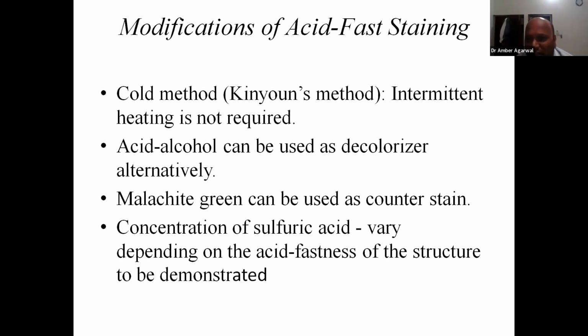Is Histoplasma capsulatum acid fast? This I would have to go back and check, it is a fungus. Other organisms which are acid fast are your parasites. Cryptosporidium, Isospora. I know you all may not have encountered them. One of the participants is saying Cryptosporidium.